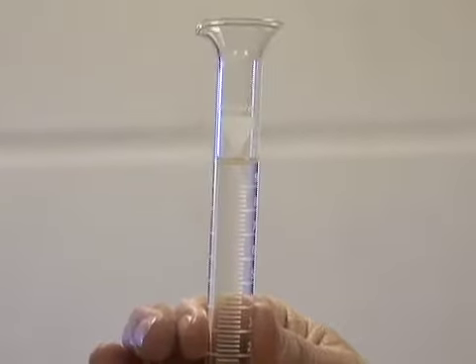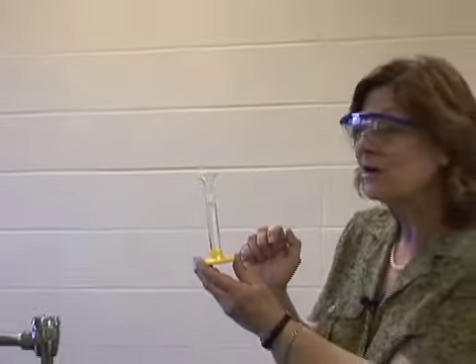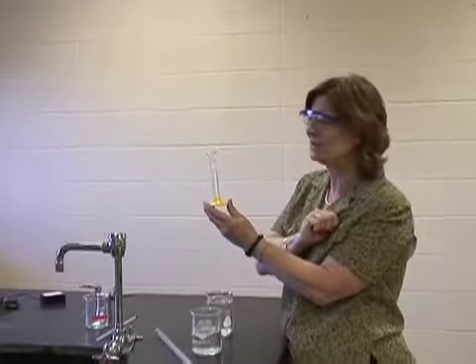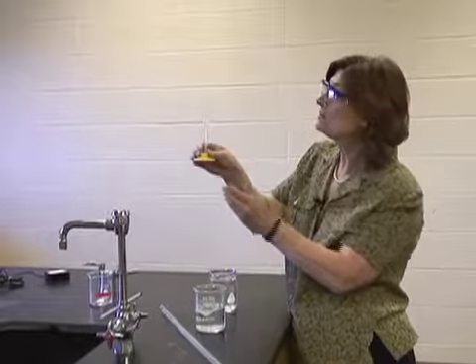And remember, the bottom of the meniscus should be at the top of that line for 10 milliliters. Now, it's not extremely necessary that it be exact. So if we had excess, we never pour it back into the original container. It could potentially contaminate the liquid. And this would be fine though.